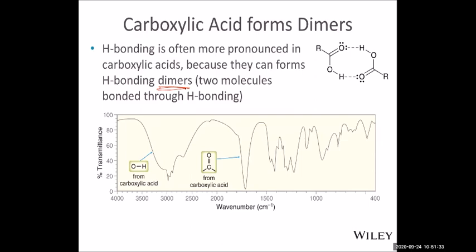The key signals for functional groups start from the 3400 wave number down to about 1600 wave number. Later I'll give you a chart about those frequencies and the signal and absorption patterns. So the diagnostic region is our main focus. Diagnostic mainly the double bond, and especially the carbonyl bond, often because it's more polar and much stronger. And you look around 2000. 2000 is where you look for the triple bond, carbon-nitrogen triple bond. Even though the atoms are heavy, carbon-carbon or carbon-nitrogen, the triple bond gives you stronger bonding, so the frequencies are high enough that you can see it in that range. And typically they are very small and sharp because this kind of bond in the molecule often is not a large number.